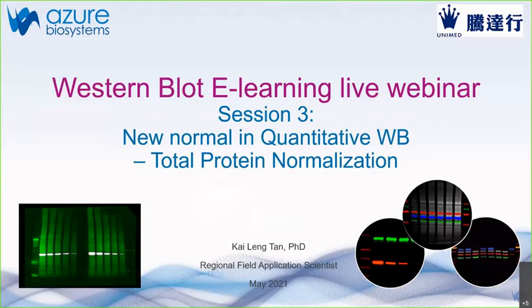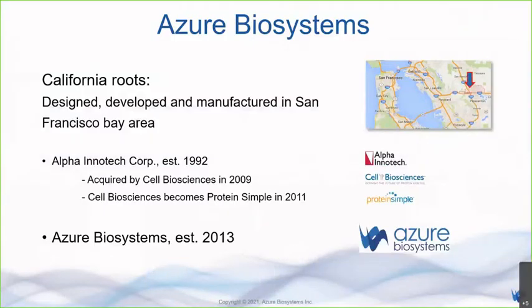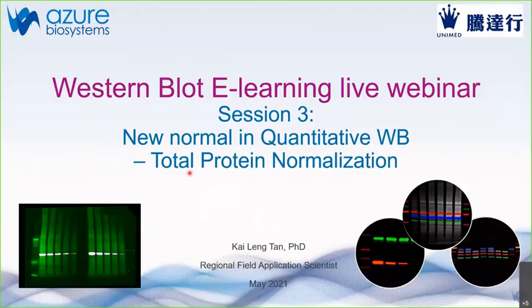Today we will talk about, we are in the final session of the Western Blot e-learning live webinar. Today we will focus on total protein normalization. Sorry, let me take out the laser pointer, which is a new normal in quantitative Western Blot.